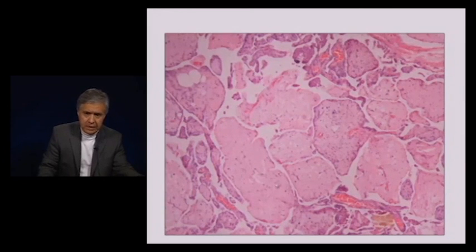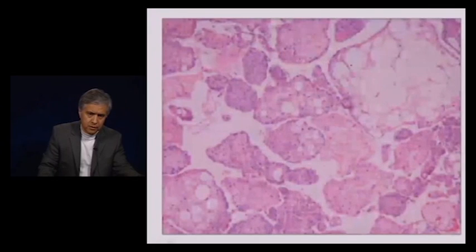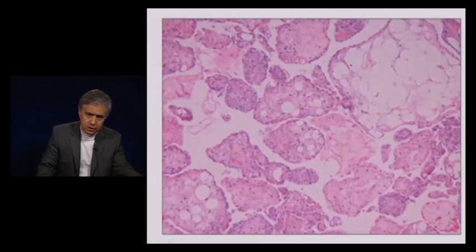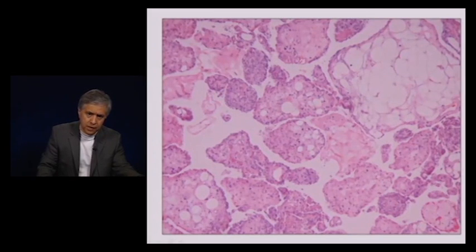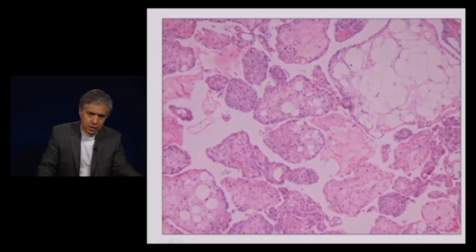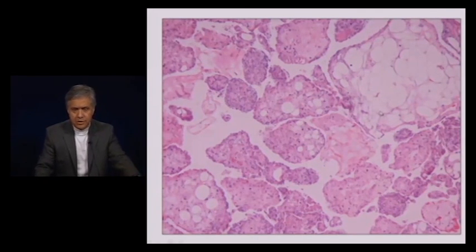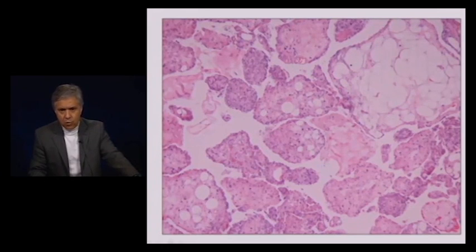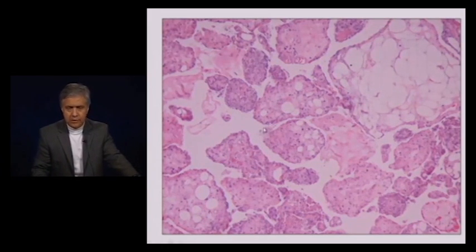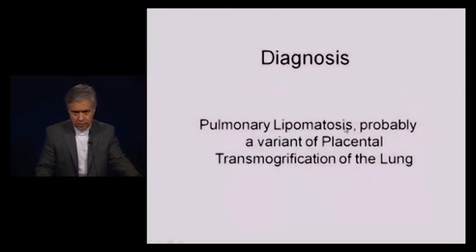There is very little inflammatory reaction present in those areas. The other area is mature adipose tissue, and in some places there is a combination of the mature adipose and the inflammatory fibrous or fibrinous component. The important thing is the distribution and how one will associate this with a particular entity.